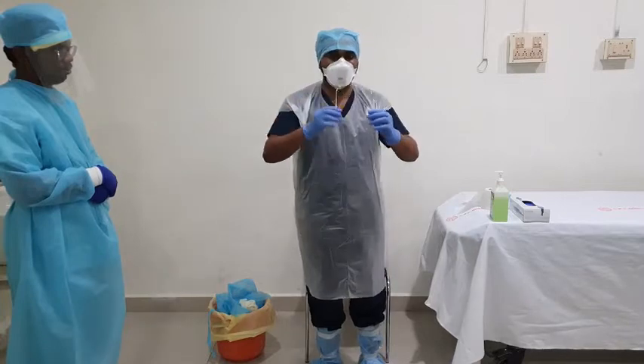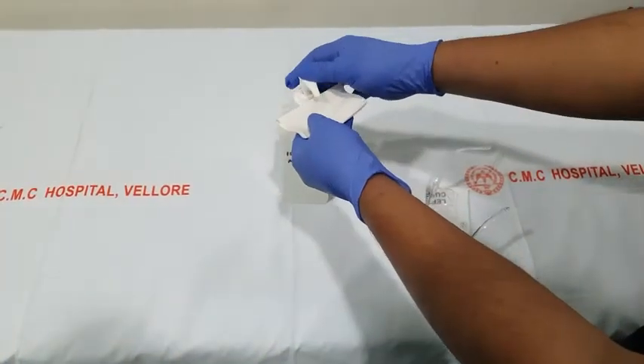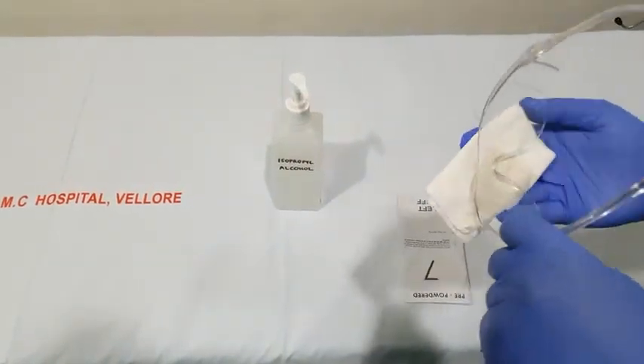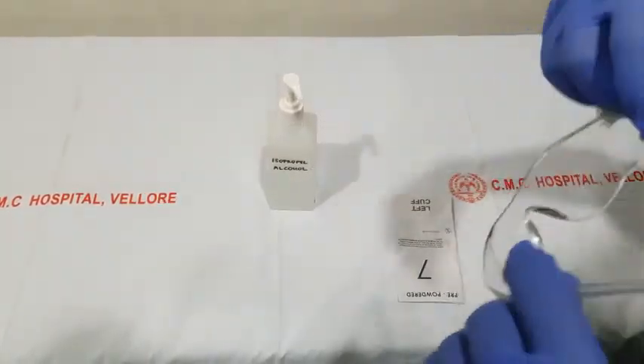With your clean gloves, remove your goggles without touching your face. As the item is reusable, clean it with tissue soaked in isopropyl alcohol and place it in the appropriate container for further use.